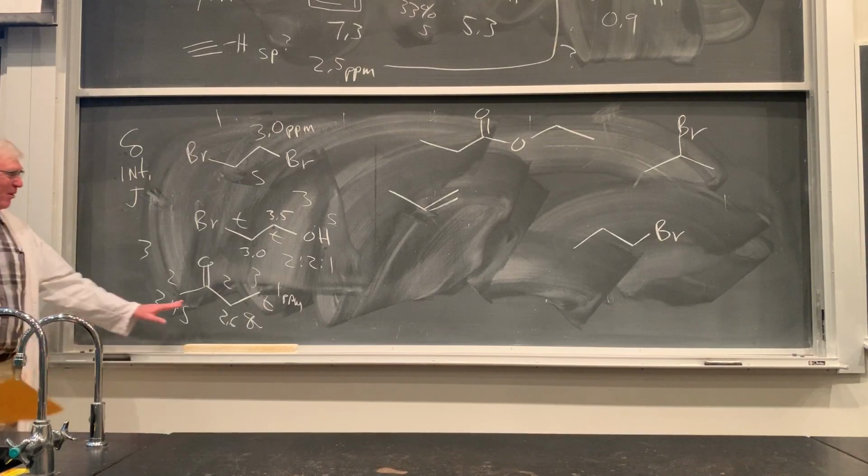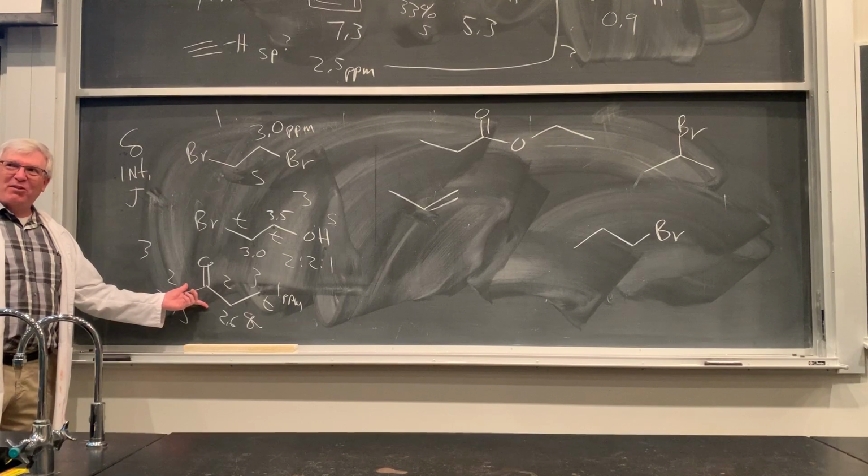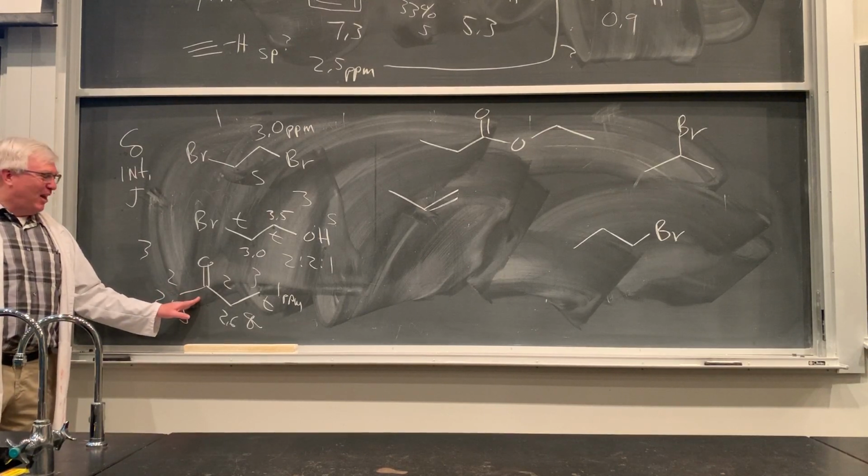Okay. So it tells you a lot about the molecule. There aren't many other molecules that fit that bill. And especially if you add in the mass spec and IR data, you can tell that that is 2-butanone.